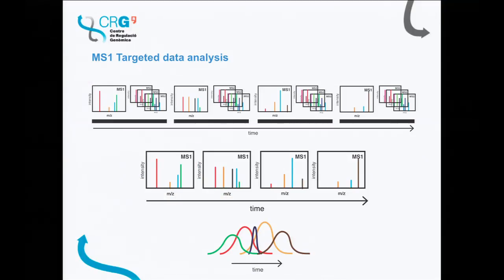So just to summarize what both of you said: if we want to always be super clear about what we are doing and what we use the technique for, we would need to generate super long names where we specify what we are doing in the MS1 for acquisition, what in the MS2, and what we do with the data afterwards in terms of analysis, right? Then we would always be really clear about our mass spec data, and the titles of the papers would be endless.